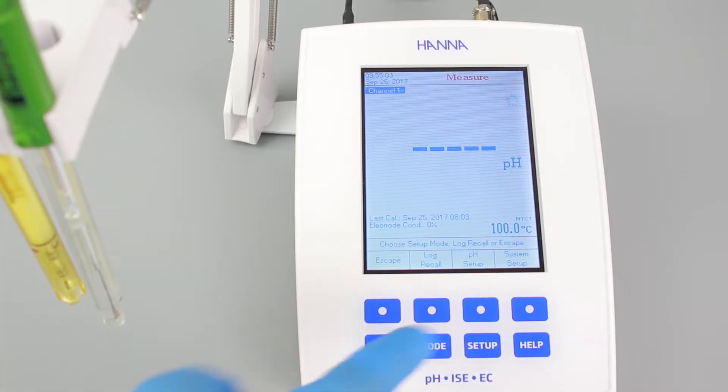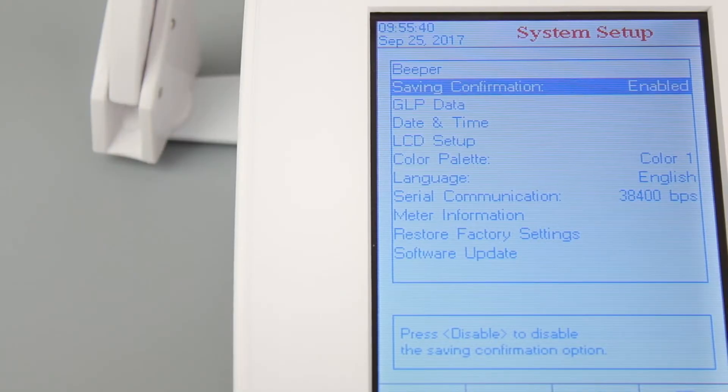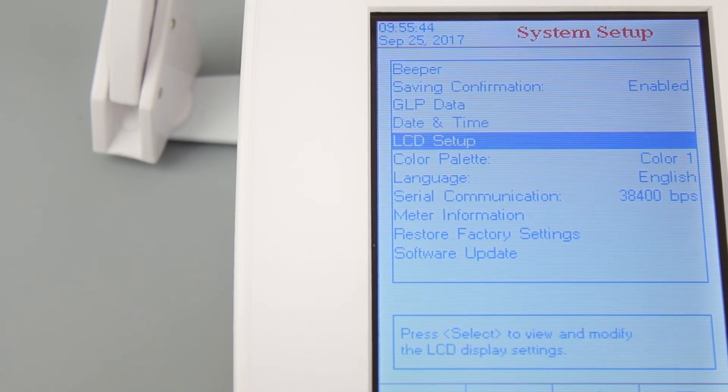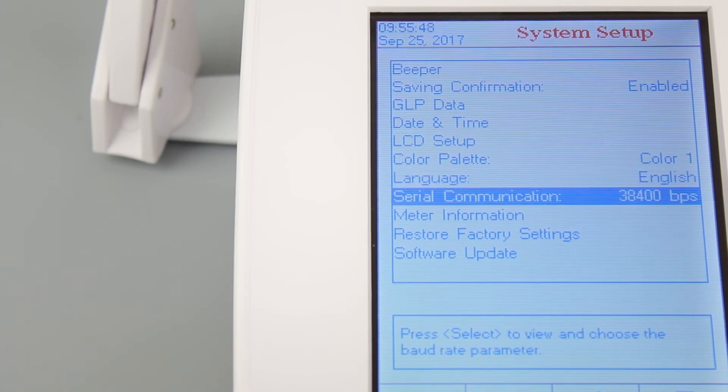Once the meter is on, you'll find that there are many different options to choose from. We recommend starting with the System Setup. Press the Setup button and then System Setup. This area of the menu lets you set the date and time, GLP data, and LCD settings. You can also view information about your meter and other operational preferences that you can set to your liking.